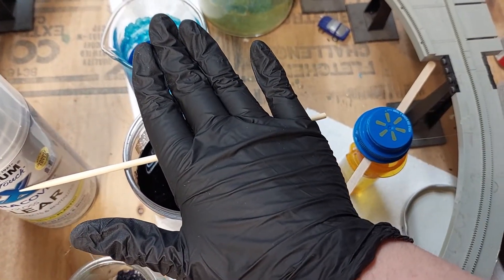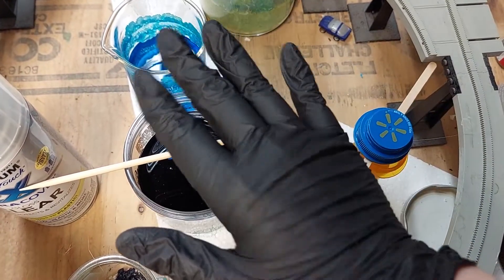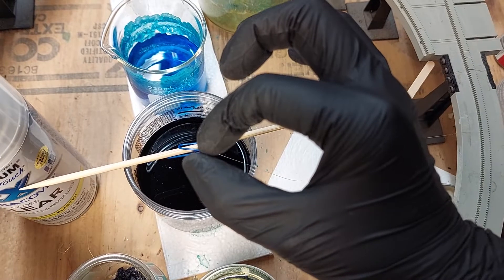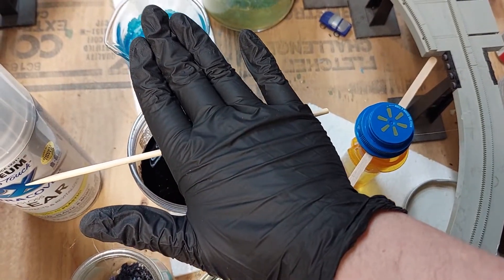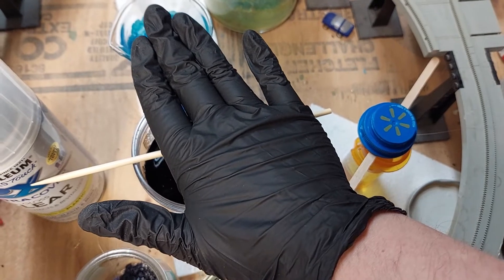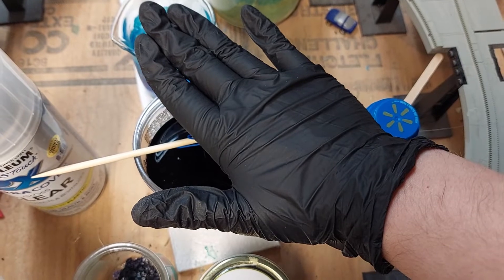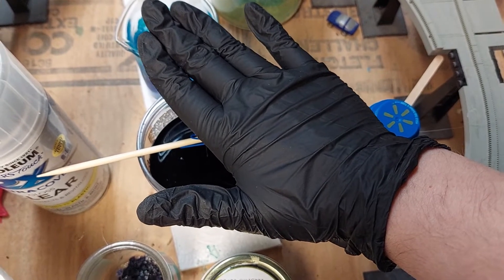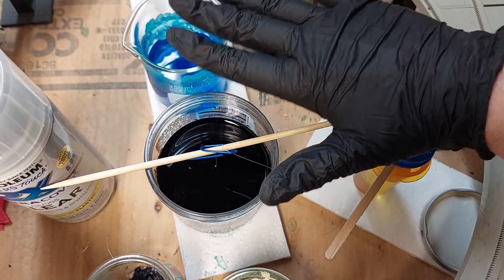I recommend starting with the container partly covered so the crystal doesn't grow out of hand. If you see the crystal is not really growing much, open it up a little bit more. And when the crystal's growth is slowing down, start opening it up more and more.